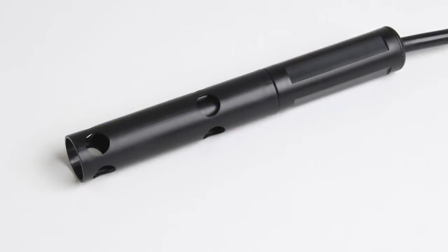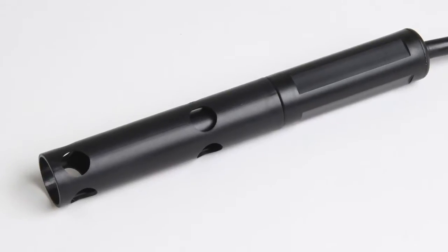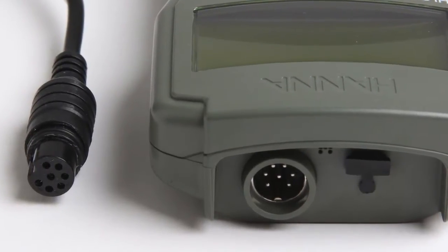The portable meter also comes with the HI-76403 polarographic DO probe with integrated temperature sensor and protective shield. The probe connects to the meter through a single cable with a waterproof quick connect DIN connector.